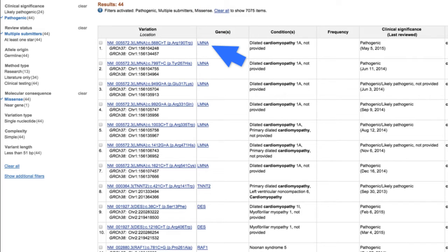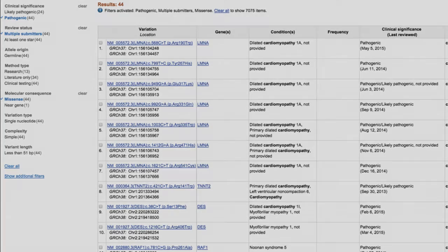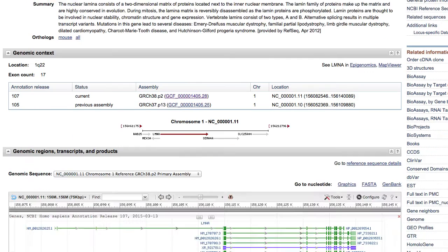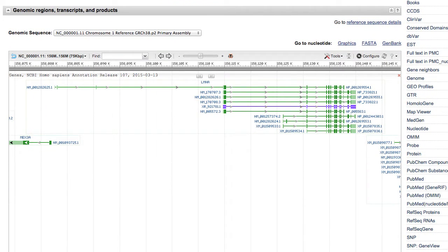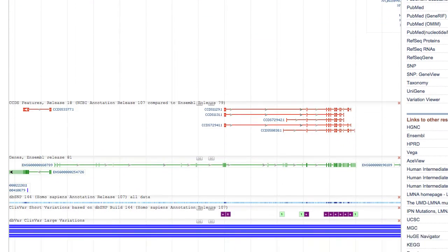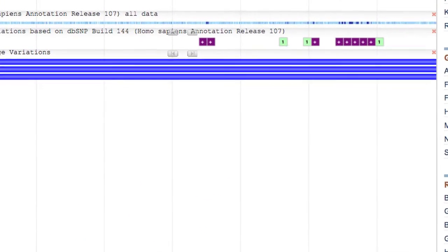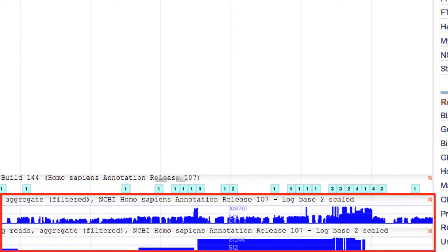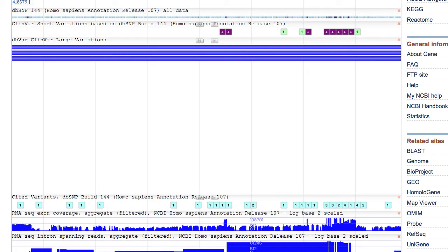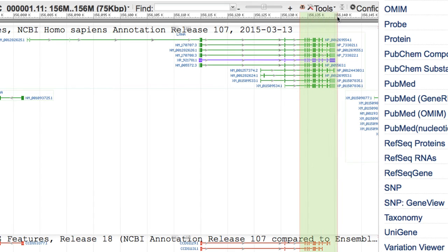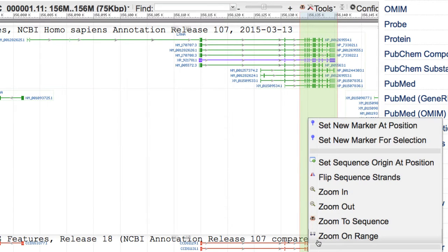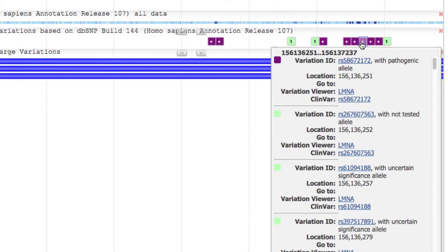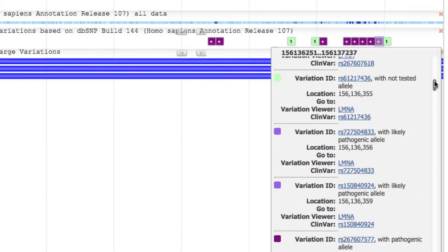We can also search by gene. If I click on one of these gene symbols — say lamin A — it takes me to the gene page for that particular gene. I can see a whole bunch of isoforms in the sequence viewer. If I scroll down, underneath the isoforms I get a whole bunch of ClinVar variants along with other information. If I'm interested in one of the last exons, I can use the range tooltip to zoom in on that part of the gene, then mouse over one of the purple ClinVar boxes to show variants in that particular exon region.